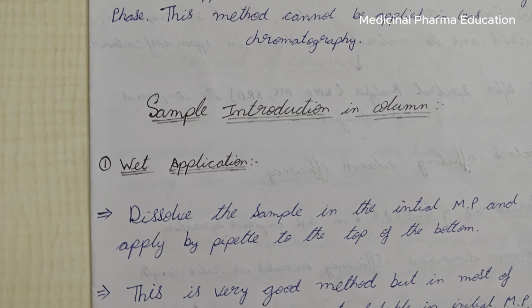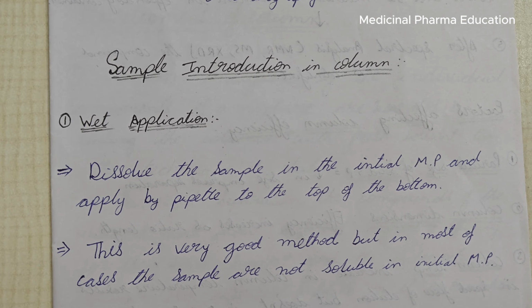Okay, next we'll start with the sample introduction in the column.